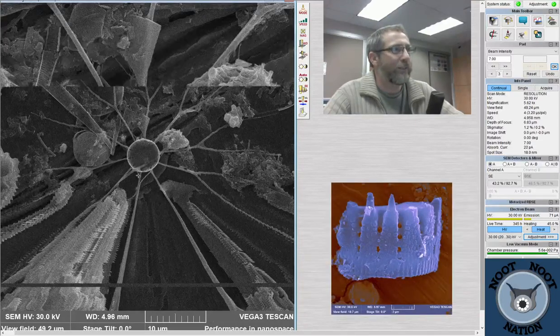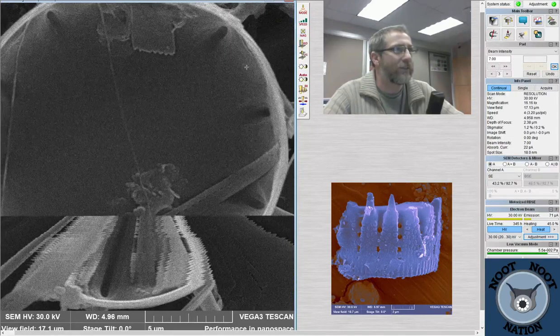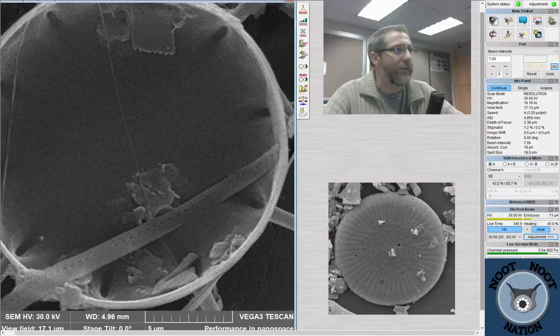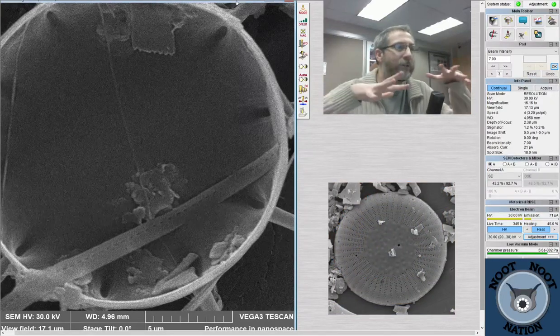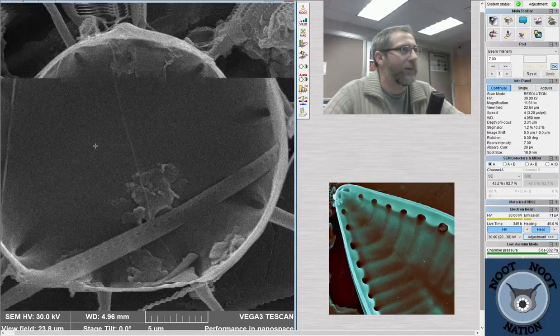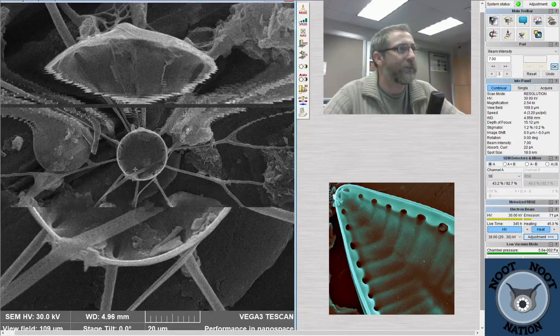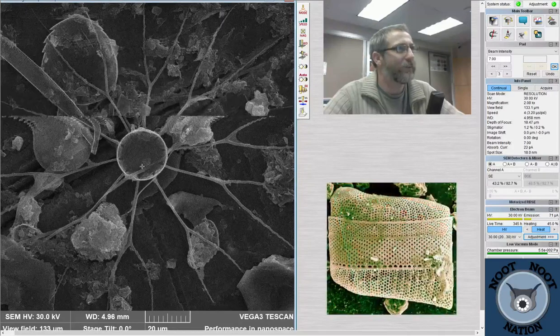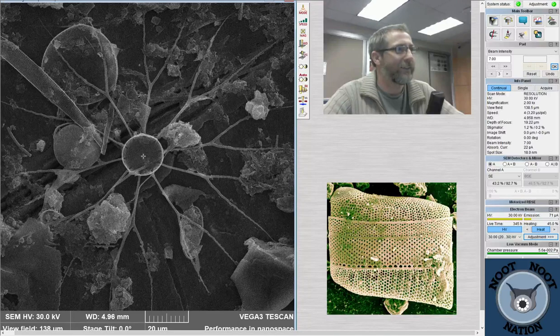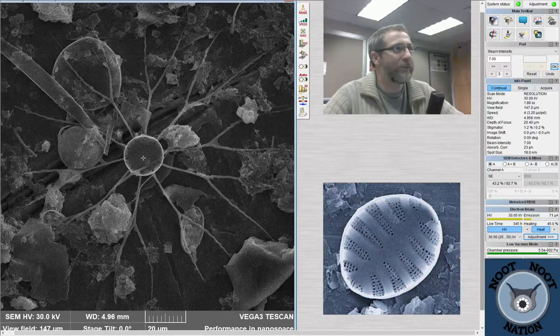If we zoom in, we can actually see the inside of the diatom on this one. You see that those are not just spines, but rather like Chaetoceros, they're tubes that I think they can put their chloroplasts in and expand their area for sunlight. So that's a really cool looking diatom. Super, super interesting, and it landed more or less clearly on the stage without having a lot of junk on top of it, which is nice.